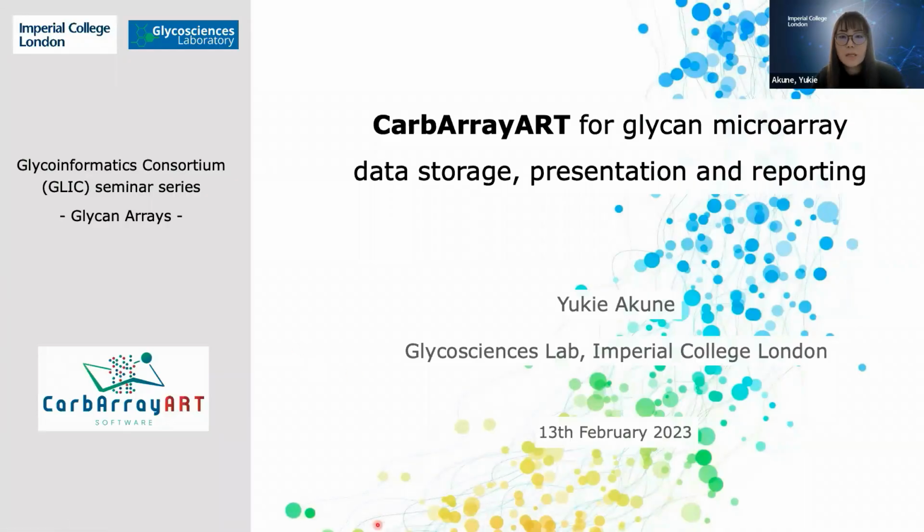So yes, my talk today, and thank you very much everyone for joining today's webinar. I'd like to introduce the usage of CarbArrayART, the software for day-to-day data storage and data presentation, also a data sharing software tool.